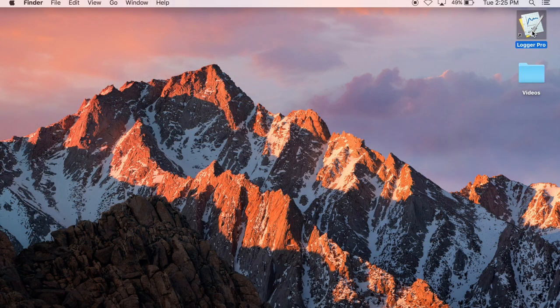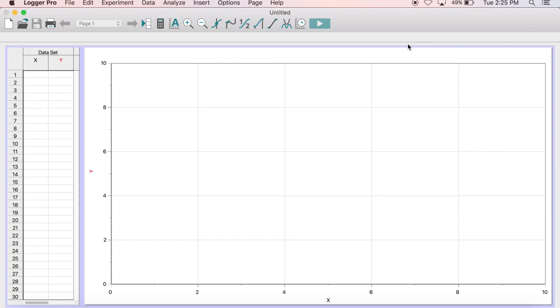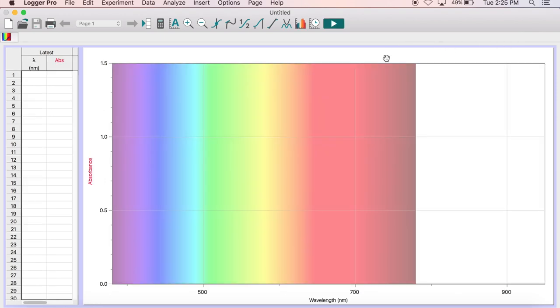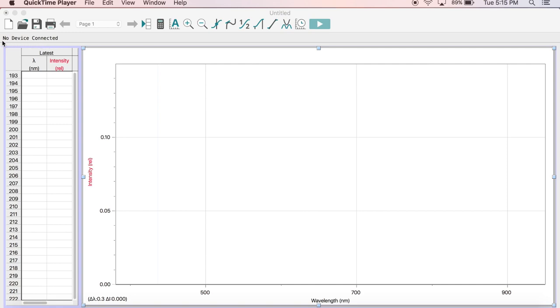To begin, first plug in the spectrometer to your computer and launch the Logger Pro software. You should see a rainbow background if it is connected properly. If you see a No Device Connected error, try unplugging the spectrometer, relaunching Logger Pro, and plugging the spectrometer back in.